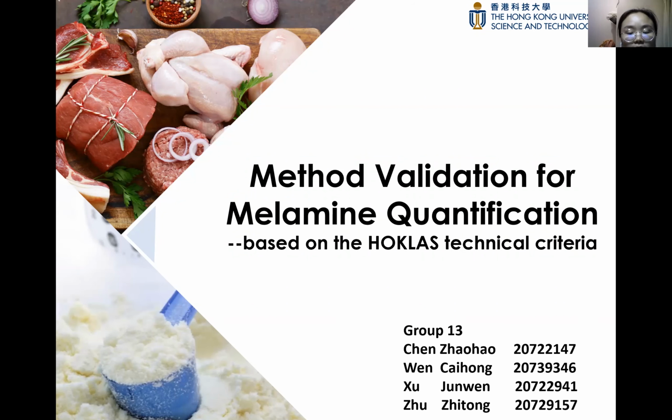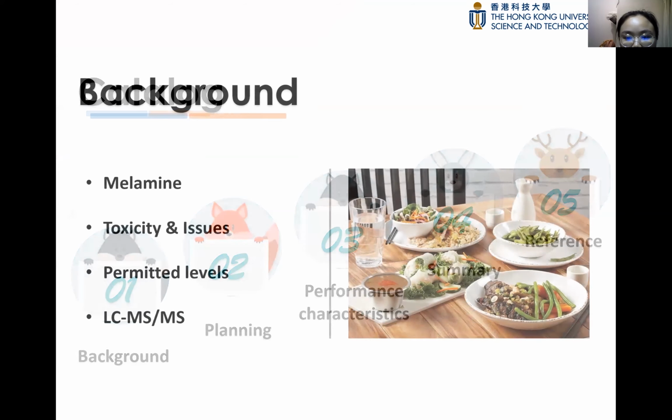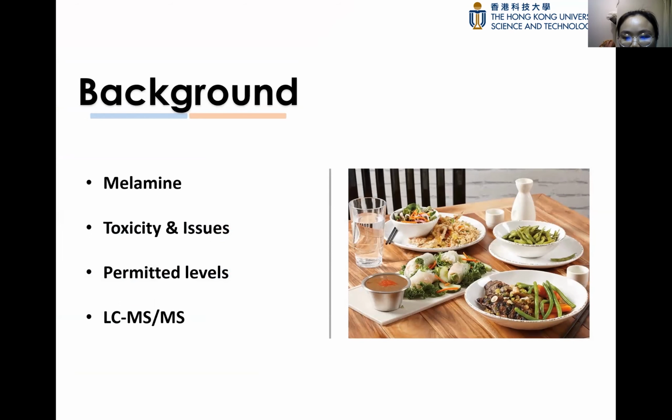Our topic is method validation for melamine quantification based on technical criteria. We will interpret the topic through the following 5 parts as shown in the PPT. First part is the background. We will talk about why we have to do the melamine quantification and which method to use.